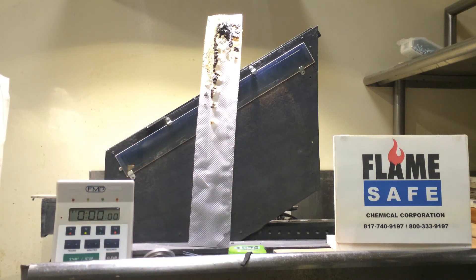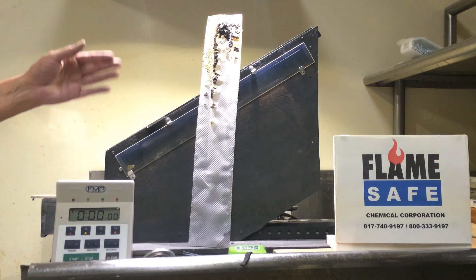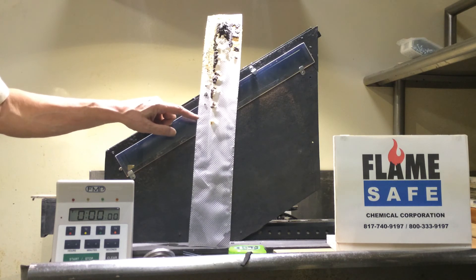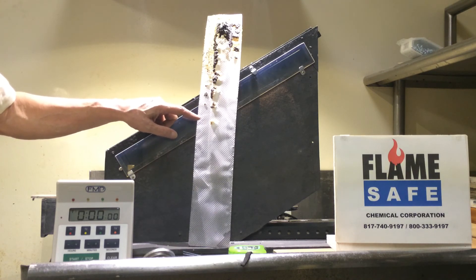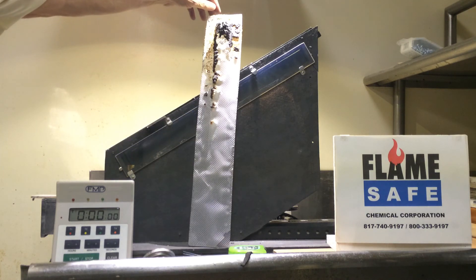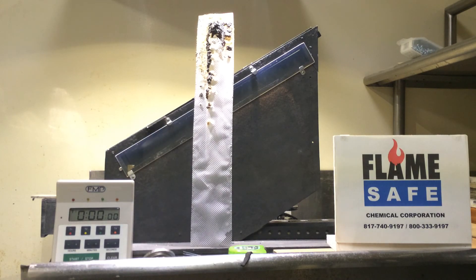From experience, if the maximum flame front is less than 10.25 inches, the ASTM E84 evaluation would be less than 25 on the flame front. The product used on this piece of plastic is Fire poly FPCC, manufactured by Flamesafe Chemical Corporation.